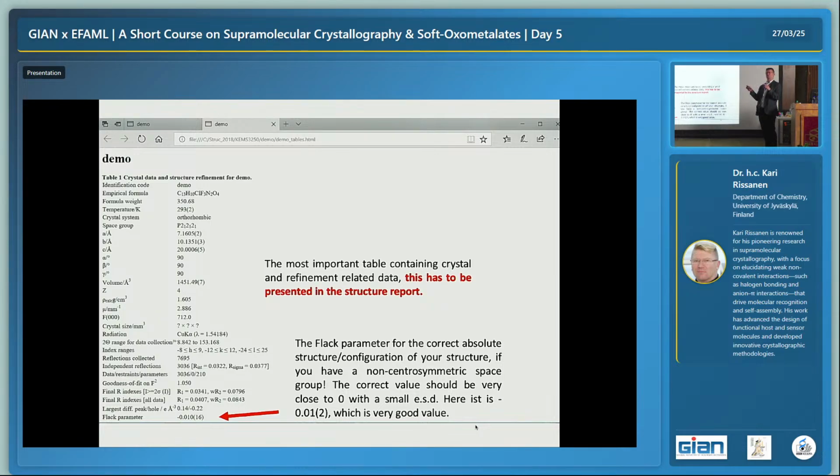What you have to do is tell the computer program to reverse all the coordinates. It can be done. You don't have to change the crystal, because only the coordinate set has incorrect handedness.